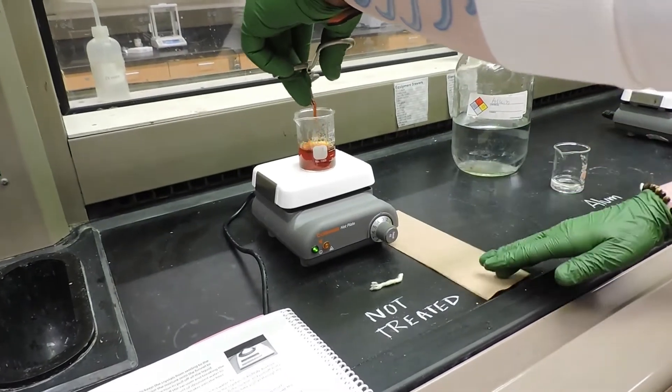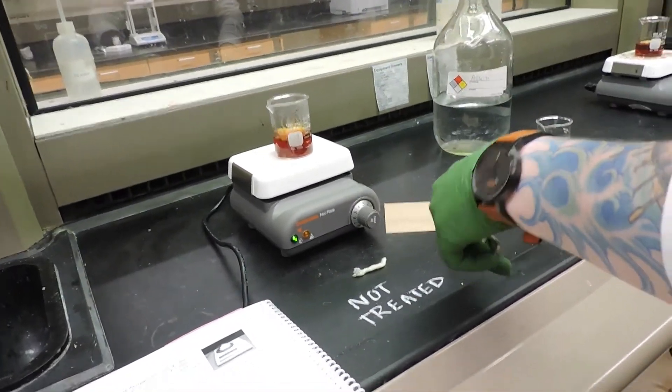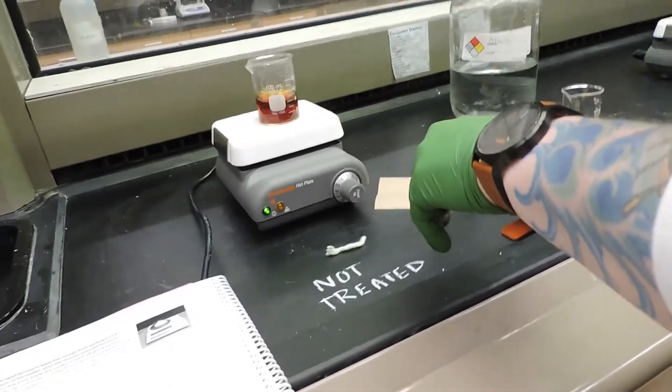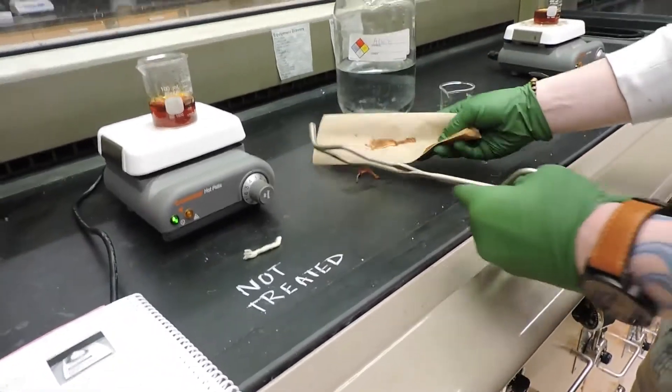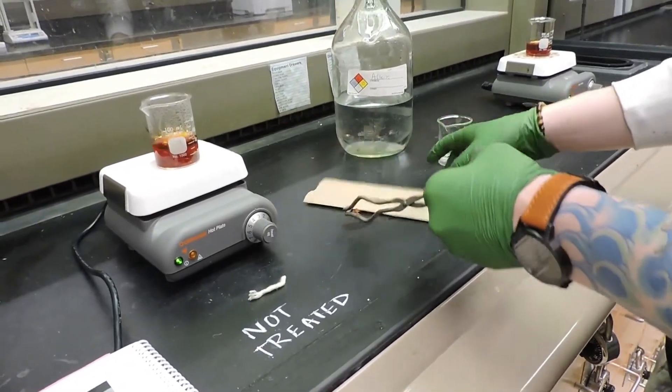So now that our piece of wool in the non-treated bath has been soaking for a minute or so, we're going to remove it from the bath and rinse it with some water and blot it with a paper towel.